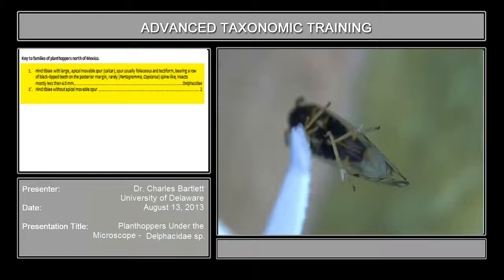And if you look at that spur fairly carefully, you'll see along this trailing margin, in here, there is a series of black-tipped teeth. The spur is flattened and bears a series of black-tipped teeth. And those are both features of the tribe Delphacene.